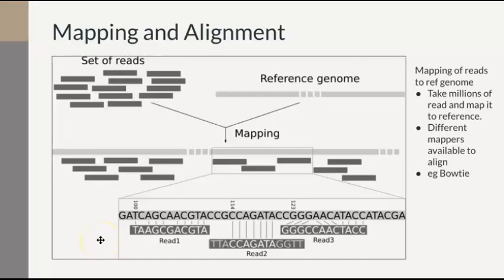If you don't have a high concentration, you'll end up with just like 1 or 2 reads covering each one of these positions, right? But we need more than that. We want enough reads so we get quite a few of a pile up in areas where we really need to know what the sequence is, because we want to make sure that we have consensus across all of these reads at each particular region.